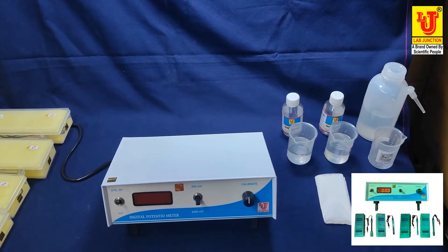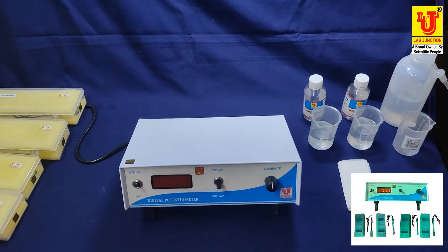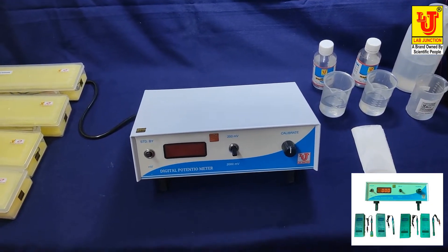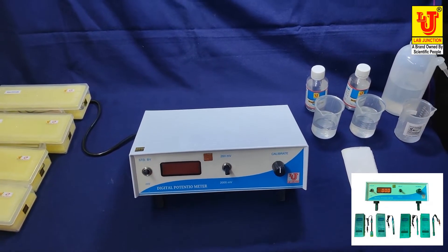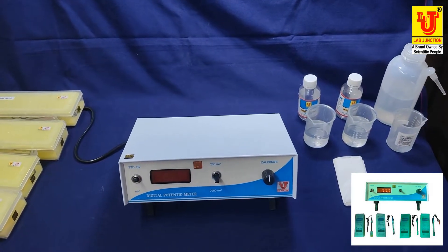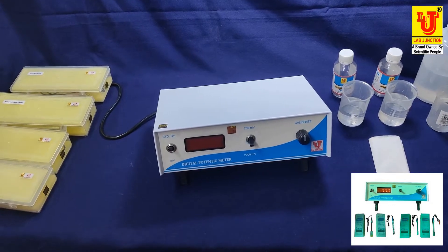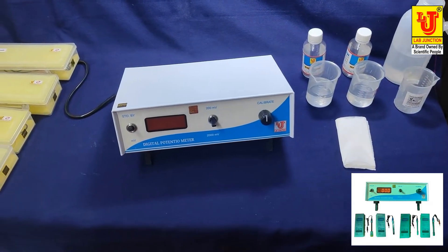This is the Lab Junction digital potentiometer model LJ-118. We have two models: LJ-118 and LJ-119. With this instrument, we supply four electrodes as accessories.